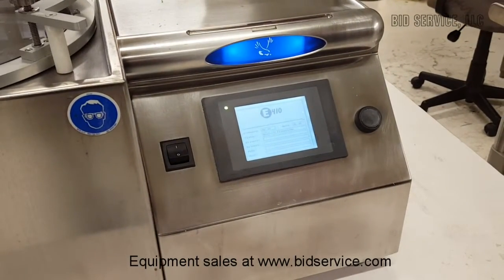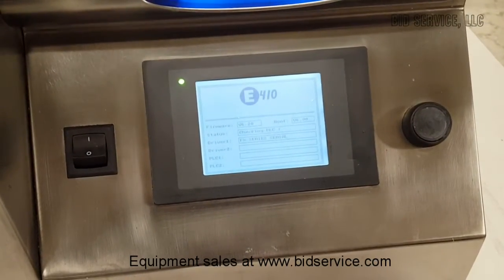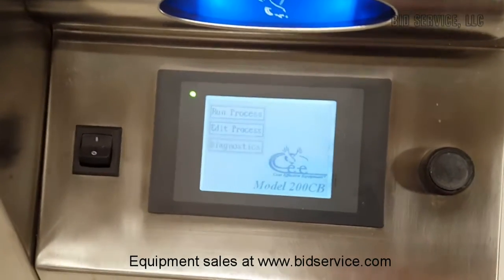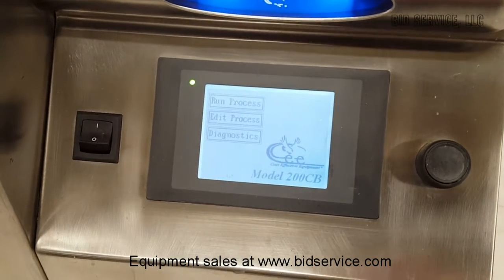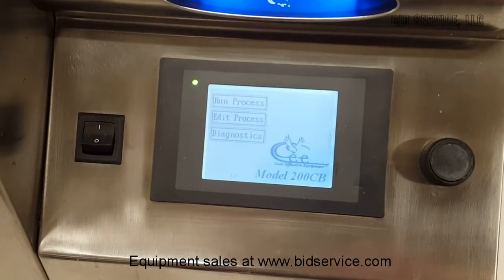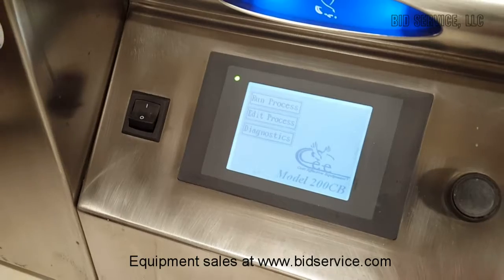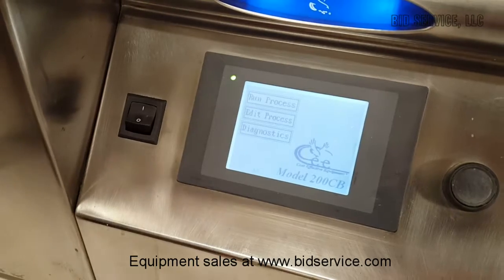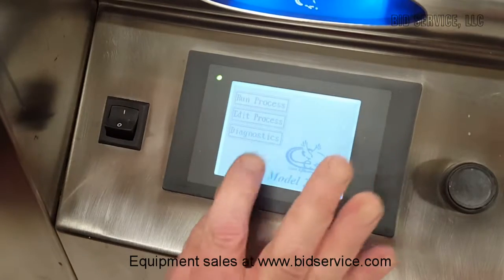There is a short boot-up that takes place. We are now at our main screen. The first thing I'd like to show you is this is very easy to operate. We have run, edit, and diagnostics.